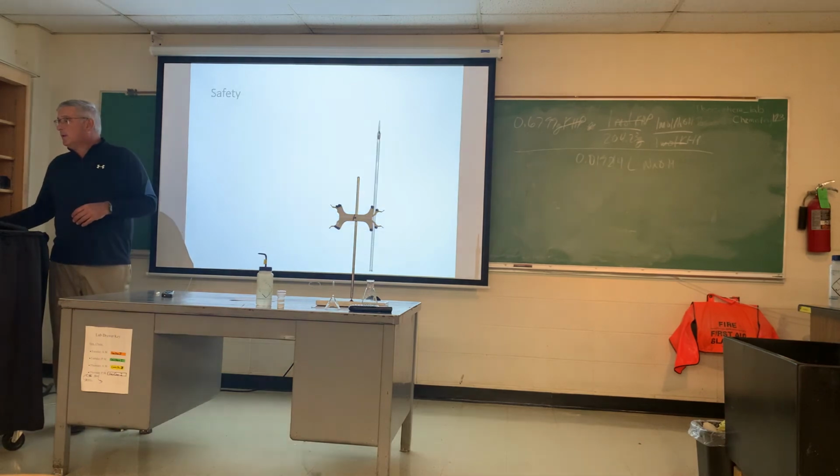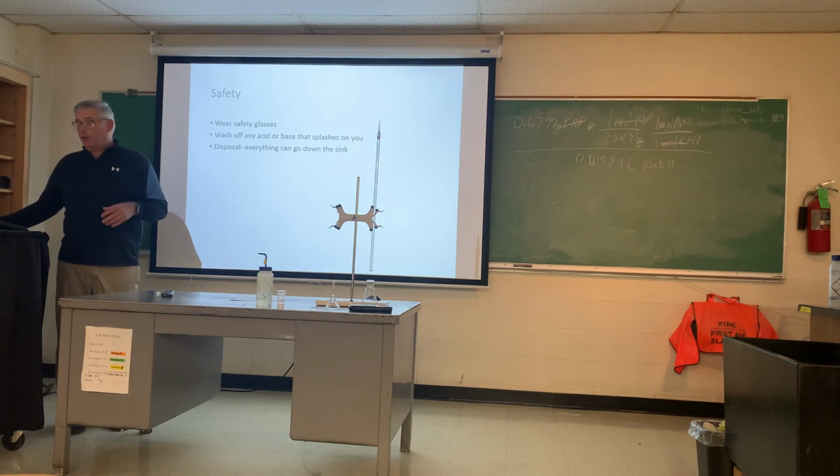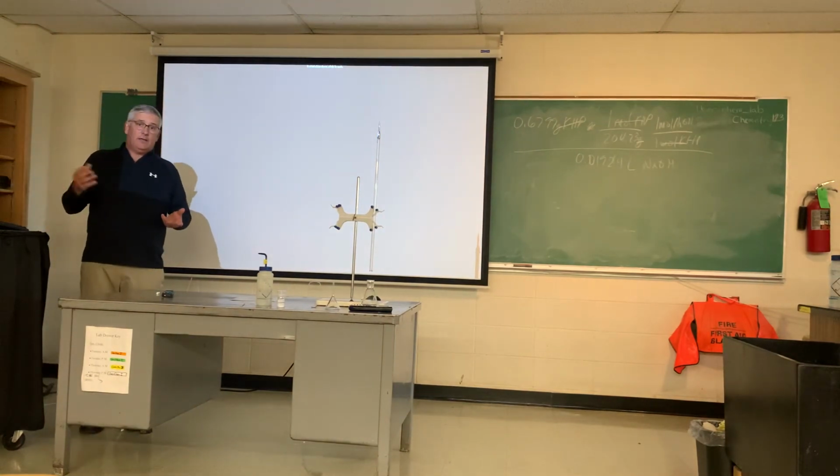All right. Safety this week, we're going to wear our safety glasses. You're going to wash off any acid or base that splashes on you. They're very low concentration. It's a neutralization reaction, and everything can go down the drain.